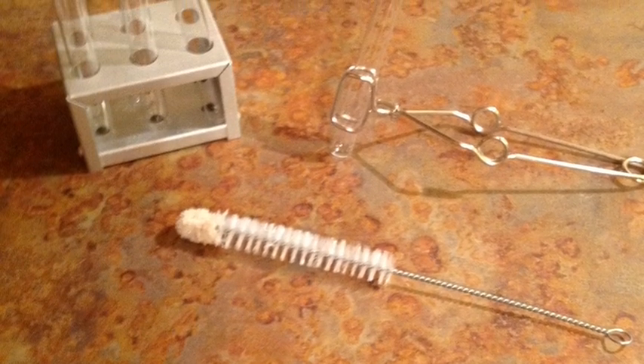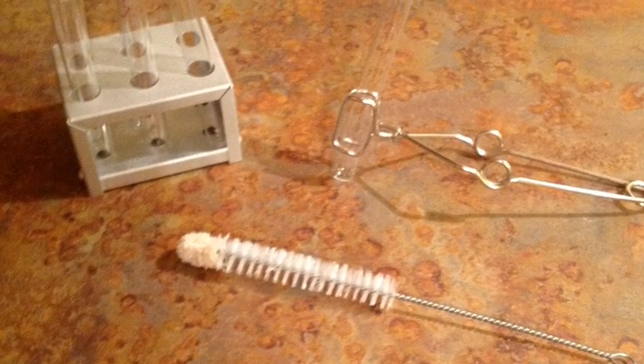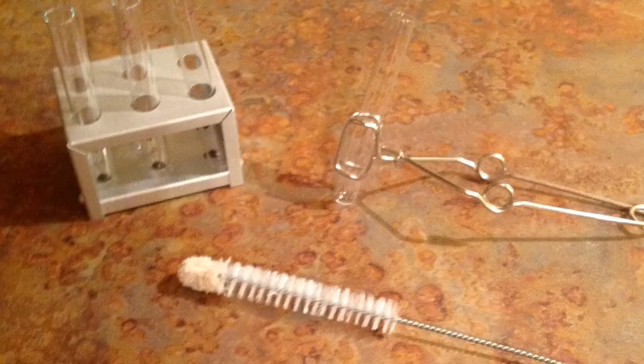Grab the test tubes and the test tube rack, the test tube clamp, and also the test tube brush for later.